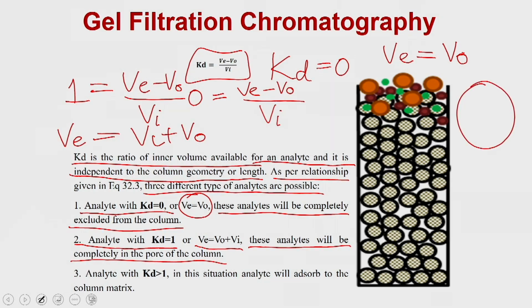If you look at the beads, the molecules sitting at the innermost area of the beads are going to give you a Kd value of 1.